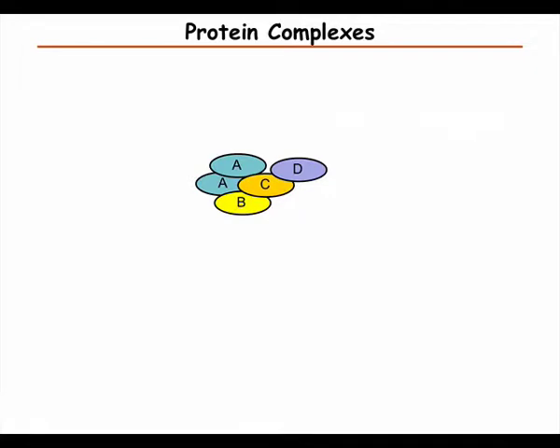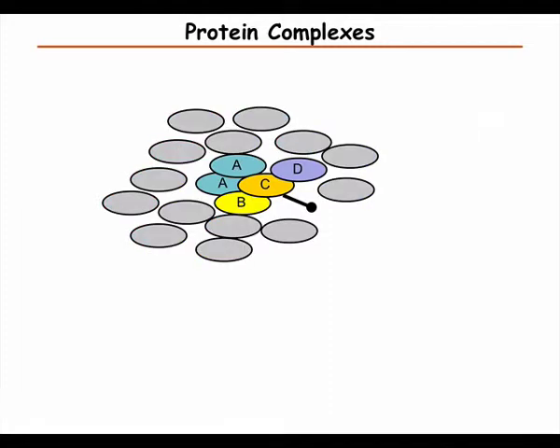So I think we mentioned a little bit about protein complexes before. One thing that we want to know about protein complexes, when we do affinity mass spectrometry, is that we have either put a genomic tag on one protein in the complex, or we have a good antibody against it, and then this is in a complex mixture.